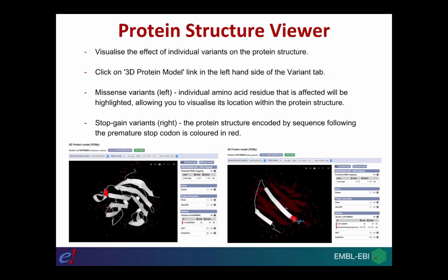Using the protein structure viewer you can also visualize the effect of individual variants on the protein structure. You navigate to a variant of interest using a variant ID, then click on the 3D protein model link in the menu on the left-hand side of the variant tab. For a missense variant, the individual amino acid residue affected will be highlighted, allowing you to visualize its location within the protein structure. For a stop gain variant, you can see the section of the protein still encoded before the stop, with the deleted portion colored in red.